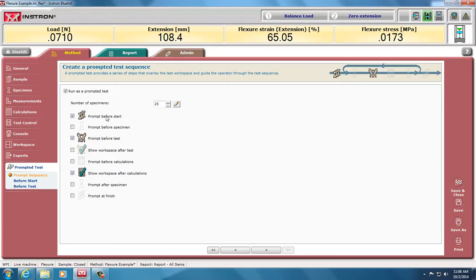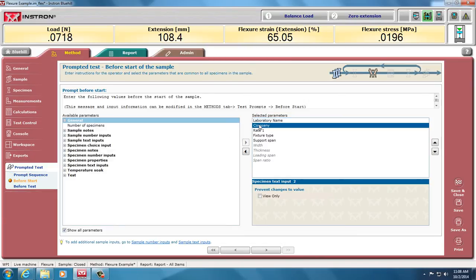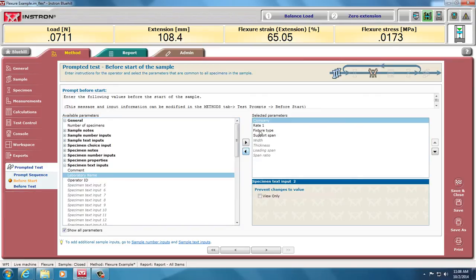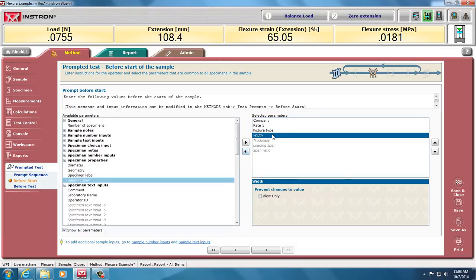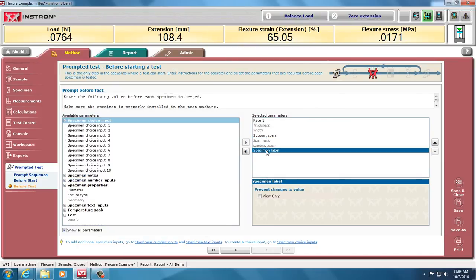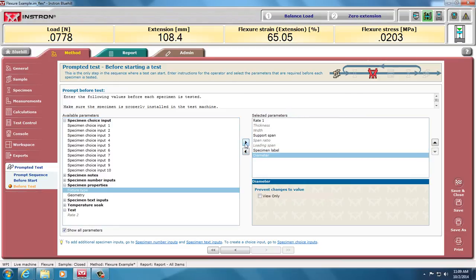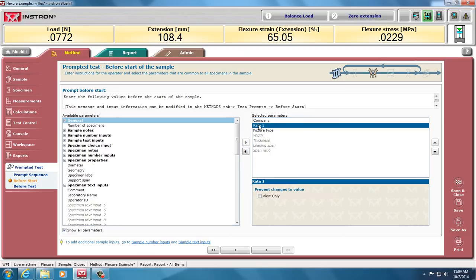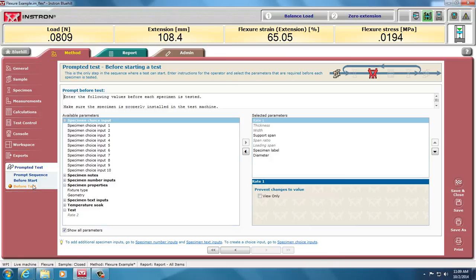In my test, I can ask what I want to do in the test, and before the start, here it says, enter your laboratory name, your company. I'm going to remove a little bit of that. My rate, my fixture type, and my support span. I'm going to remove support span from here because I'm going to ask that before each test, what's the support span? Width, thickness, span, ratio are not highlighted here because those are for rectangular specimens. For each test, I'm going to ask what's the support span and the specimen label, but if I want to do my calculations, I need to have my diameter in there. So here I have my rate, support span, and diameter. Before the start, I also asked for rate there, so I'm going to remove that because I don't want the same question twice. And then we're done and we're ready to save and close.